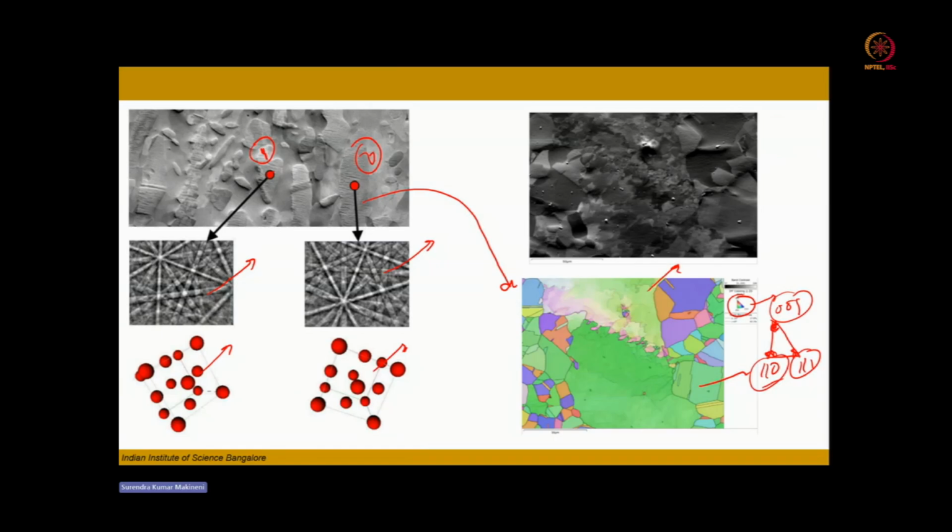Here you can see briefly how in an electron microscope we can get electron channeling contrast imaging by channeling the electrons, and with the presence of defects you get higher backscattered electron intensity at those locations. These backscattered electrons can also be used for electron backscatter diffraction patterns to get the orientation map. Now I will show you how this orientation map can be used to get the crystallography of the defects in a bulk sample.